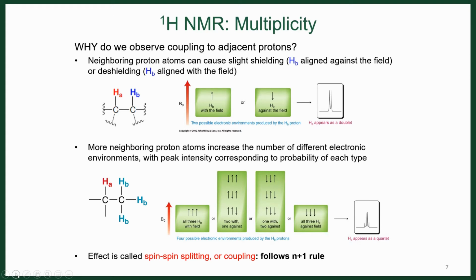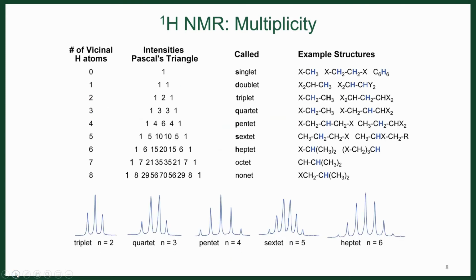And so, this is basically called the spin-spin splitting, or this J coupling value, and this is a through-bond effect of these hydrogens communicating with one another, using the electrons to relay this information back and forth. All of these values fall out in this nice intensity Pascal's triangle type of relationship, and you should know how to name each of these associated patterns, which have fairly common names.